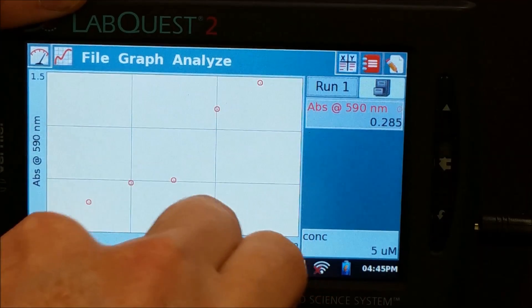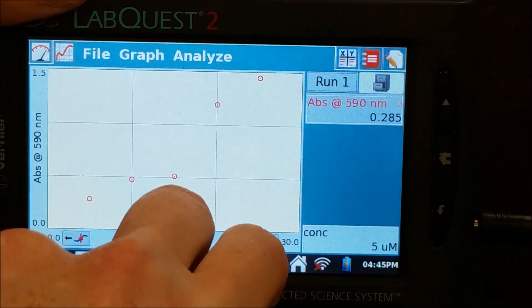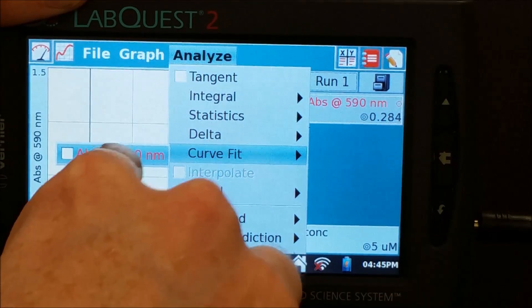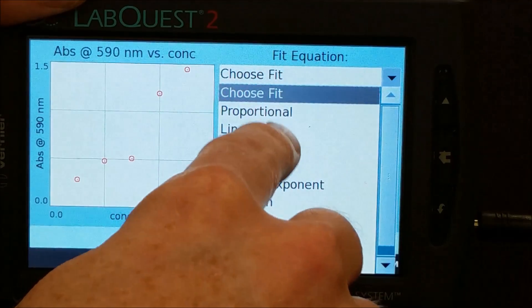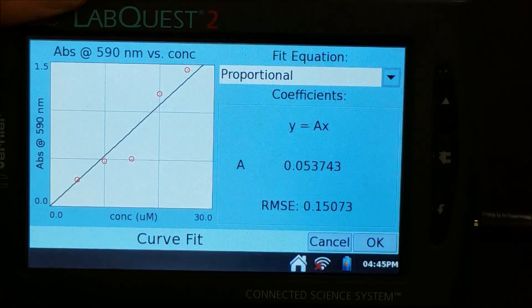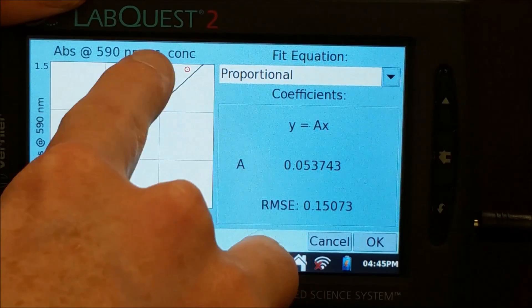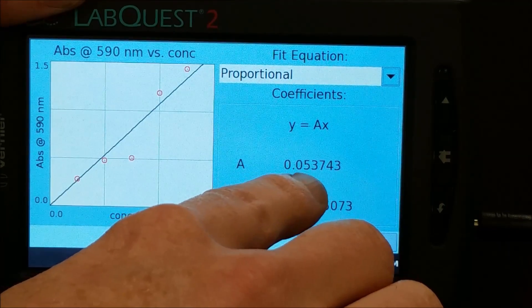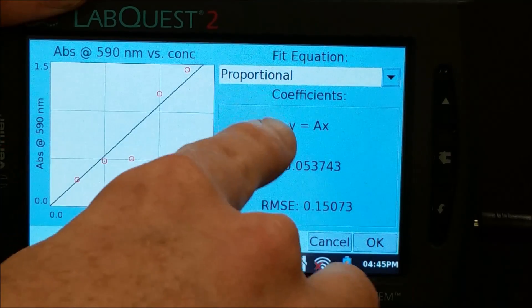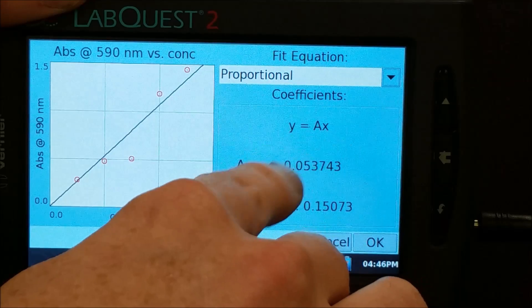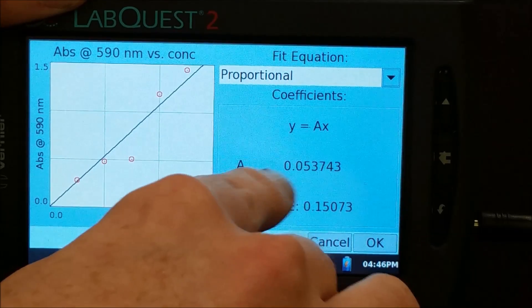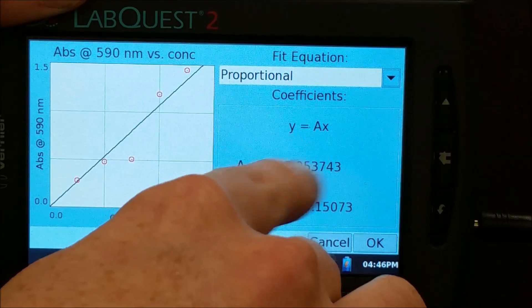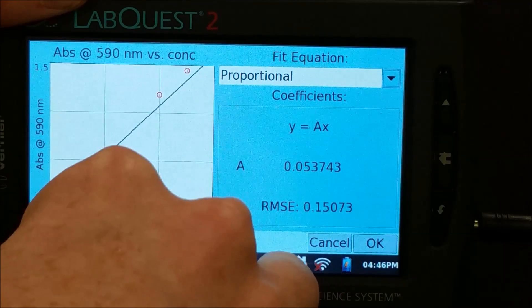Looks like I might have one bad data point. We're going to hit stop here. So we can analyze our data. If we go under analyze and curve fit and select our graph, we can add in a line of best fit. I'm going to do proportional. So it looks like this data point has brought down our line a little bit here, but nothing too crazy. And so we end up with a slope of 0.0537. And what that means is that our absorbance, the Y value, is equal to our concentration in micromolar times 0.0537. So we can use this value to convert between absorbance and concentration. And that way we're going to go through and find the rate law later. We'll be able to make that change.